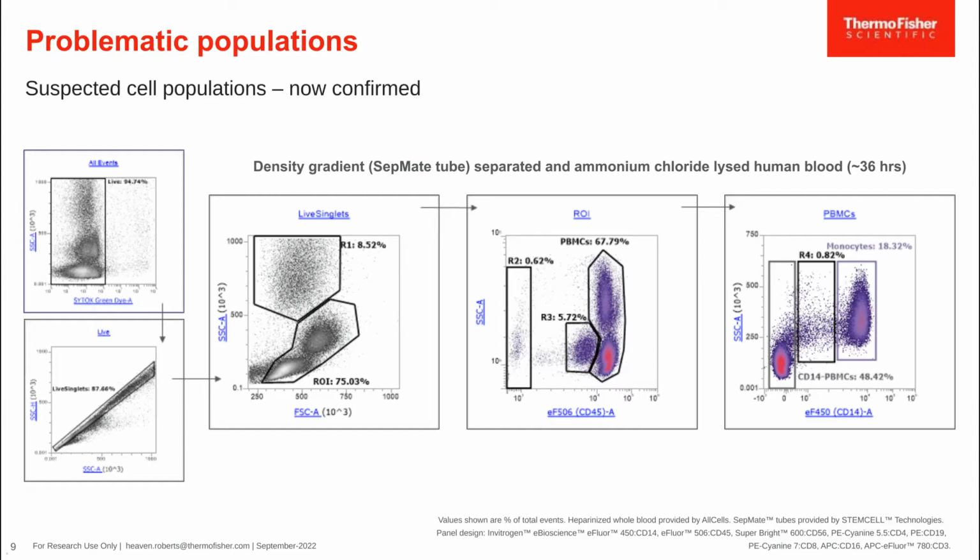I've always been trained that these cells should be gated out, but their actual placement can be a little tricky. So here they're pretty clearly separated from my main lymphocyte population, but that's in part because I've titrated this antibody specifically for this application. That's not always the case. So sometimes they're a bit more shouldered up to that main population and they can be a little harder to pull out. But some researchers have told me that they don't gate these out. They feel that they are a valid population to include in a downstream analysis, and that this kind of intermediate CD45 expression is of biological consequence and not an error and not because of necrosis.